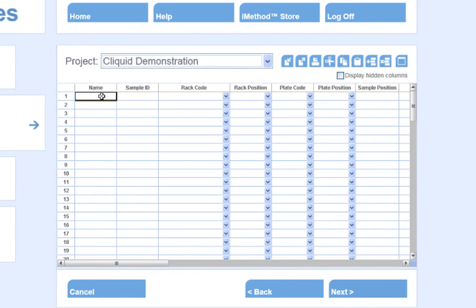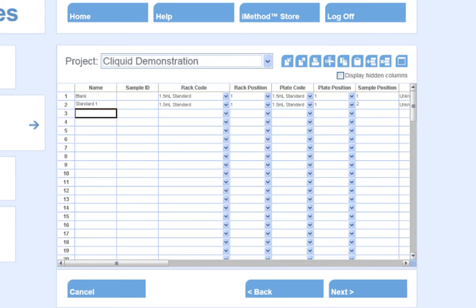We will name our samples. I can start with a blank, Standard 1, Standard 2, and an unknown.